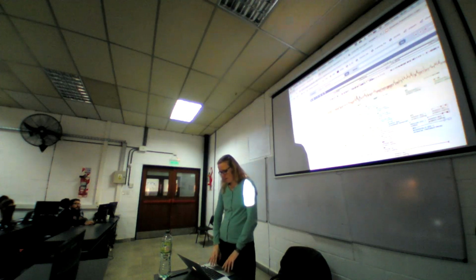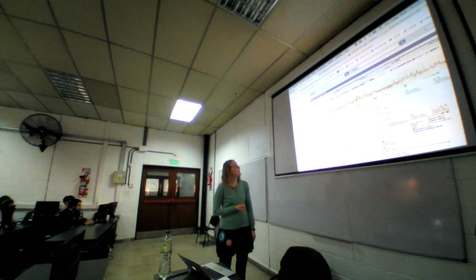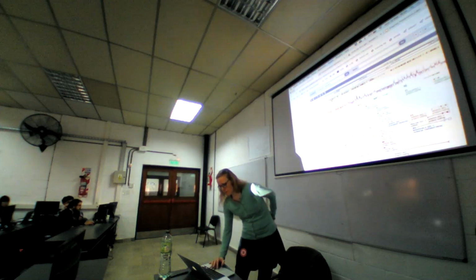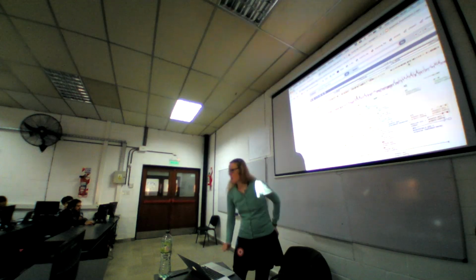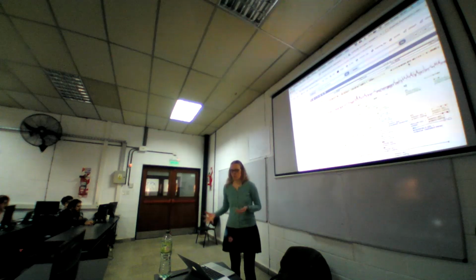And these raw data scores were then used to annotate constrained elements. These are represented as these blocks in the track above. So at each point where these scores reach a certain cutoff, we annotated one of these constrained elements. And they're called constrained elements because they are considered to be constrained by evolution.